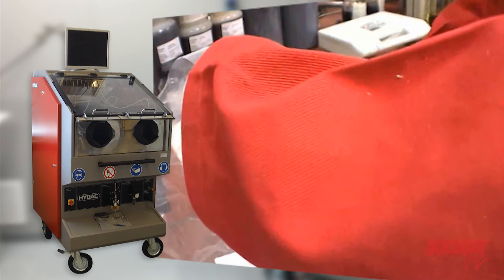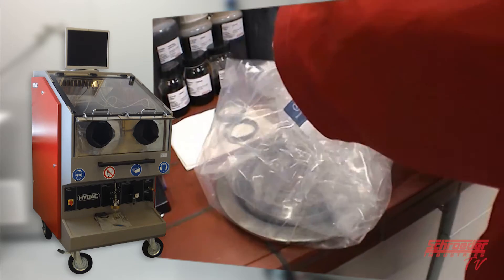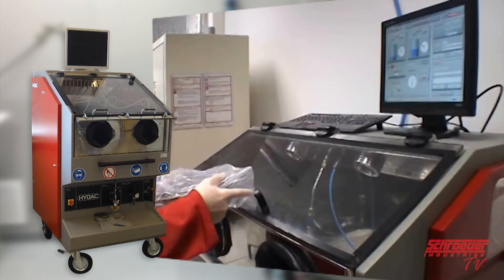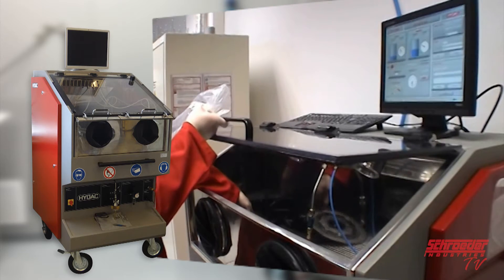Make sure that the part being evaluated is properly bagged to protect the real contamination level and to not add more contamination by handling it. Once ready, remove the part from the bag immediately before use in the CTU clean box. Open the clean box door and place the part inside.